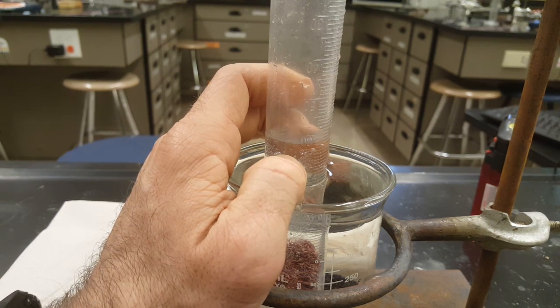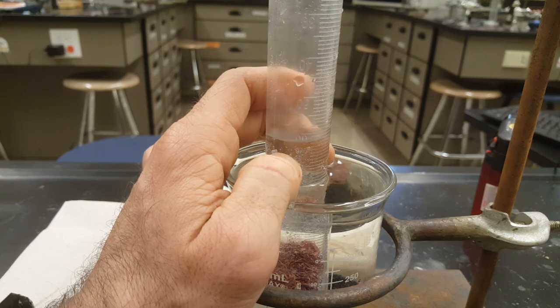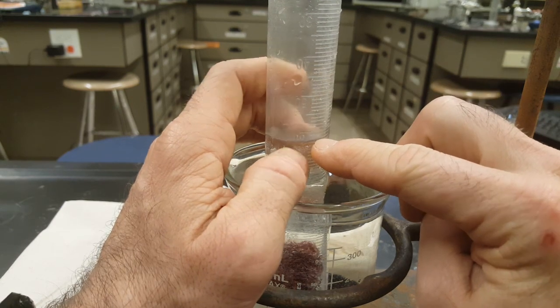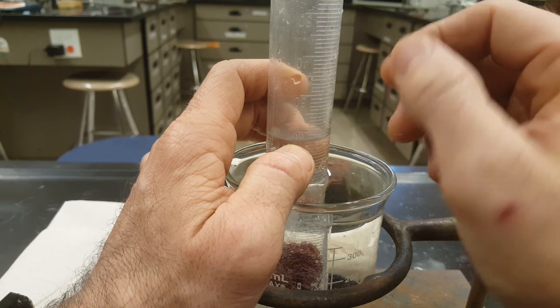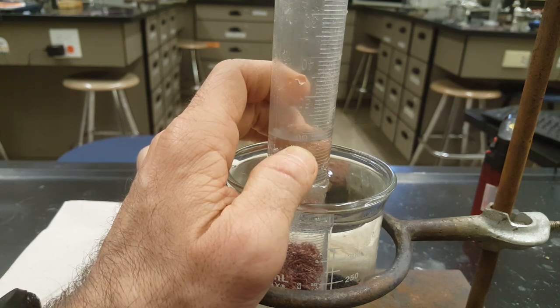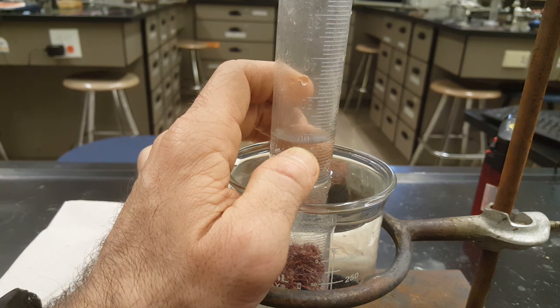The reaction's slowed down, it's almost stopped. It's good enough for this demonstration. I'm going to take a measurement now of the amount of hydrogen gas that I have made. This is tricky because the graduated cylinder is upside down. So 50, 60, 61, 62, and you have to read the meniscus oppositely as well.